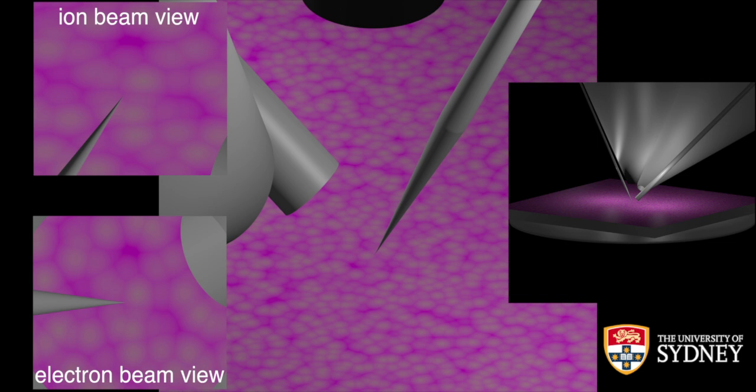The reason for that is that later, when you do the lift-out, you just want to be able to drop the stage under the micromanipulator needle, and that's a little bit difficult if your stage has a little bit of backlash and the last move you made was up, and then you're trying to move the stage down. You'll get a little bit of sideways shift because the stage has backlash, and that can break the lift-out bar off the micromanipulator needle or just crash it into something. So the last stage move you want to make before you attach the needle to your lift-out piece is actually down.